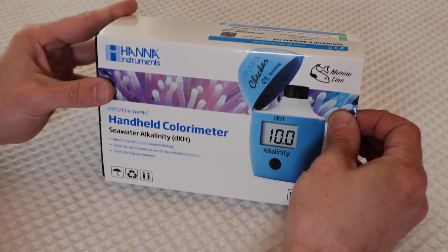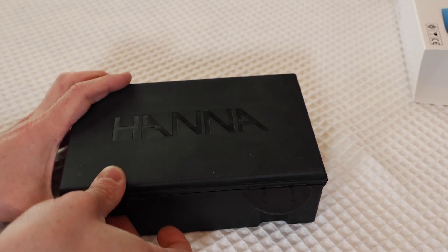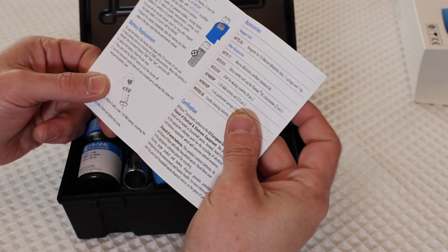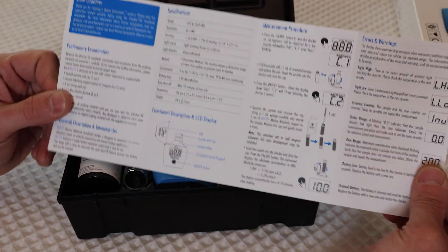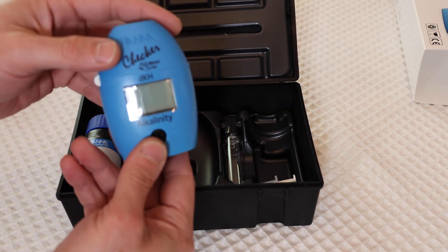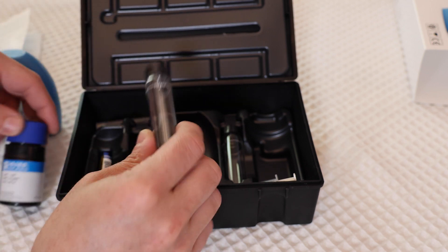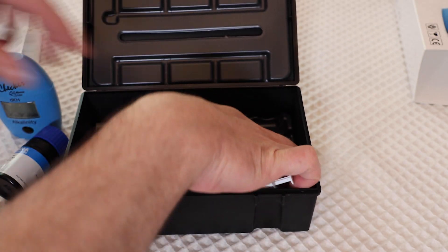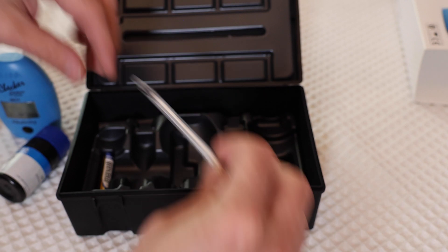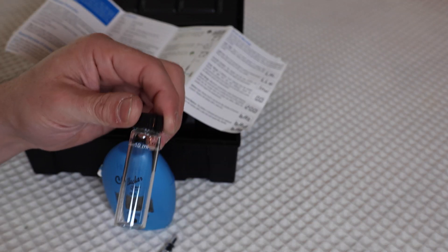Alright, so here's the alkalinity Hanna checker. It comes in a nice little plastic box. We have one piece of paper for instructions. We have our checker right here, here is some of our reagent, test vial, syringe — and it even comes with a battery. I'm going to get some aquarium water and fill it up. I'll be right back.